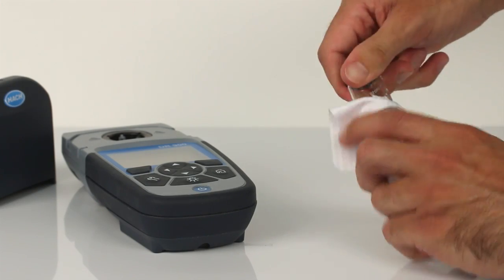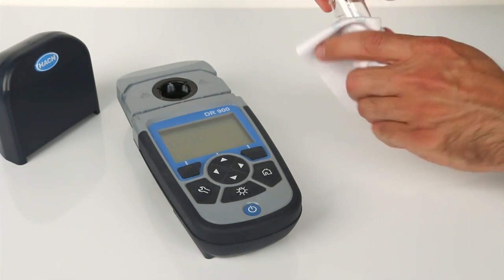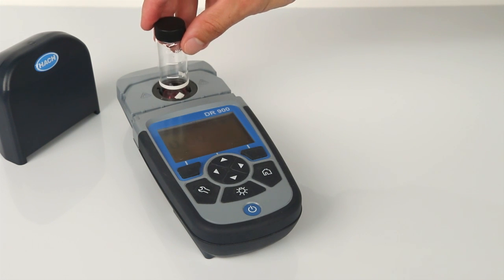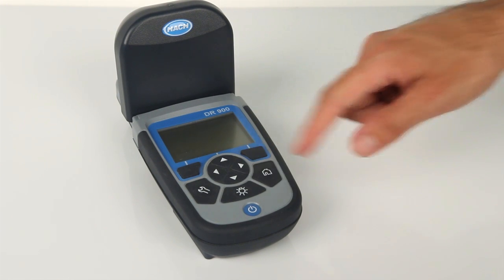Immediately clean the prepared sample cell, and within 60 seconds of adding the reagent, insert the prepared sample cell into the cell holder. Make sure the diamond on the sample cell is facing toward you, and place the instrument cap over the sample cell. Press the read button to display results.